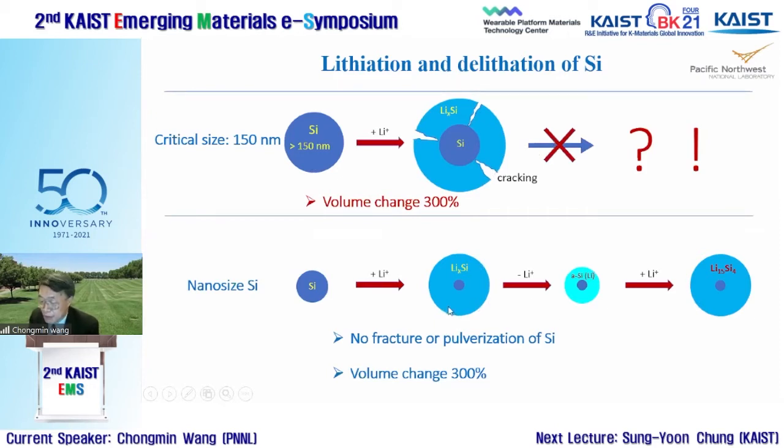Okay, let's use smaller ones, and you lithiate it with a core-shell structure. One thing you can see is that regardless of how large the silicon particle is, or how long you lithiate it, you always maintain a small core in here. This is because of stress fracture; the more you lithiate it, the more stress builds up, and thermodynamically you can no longer make the whole particle fully lithiated. That's a principle I think is well understood.